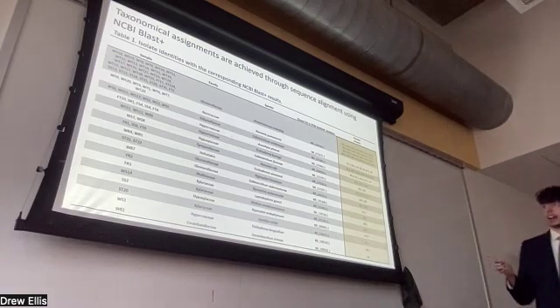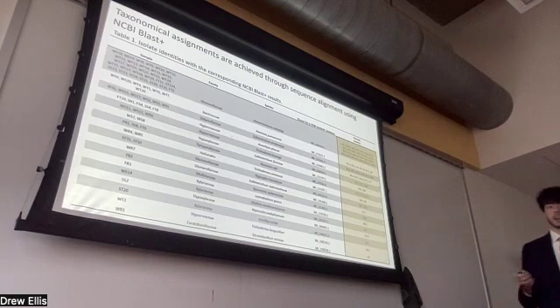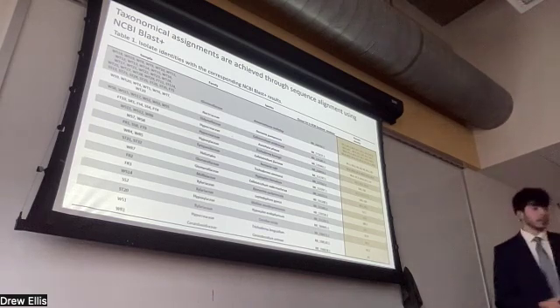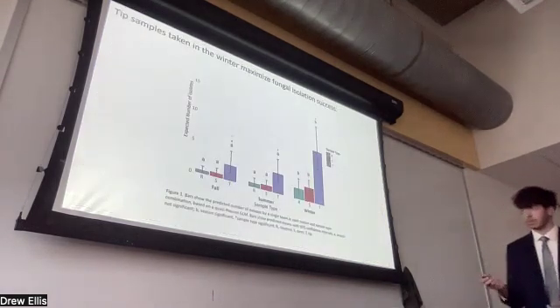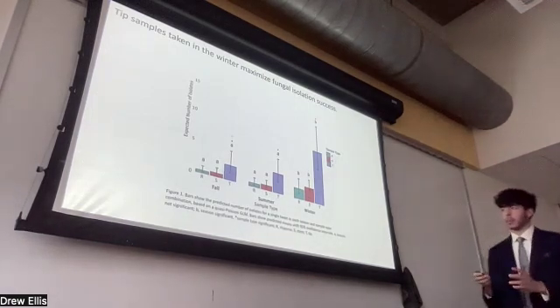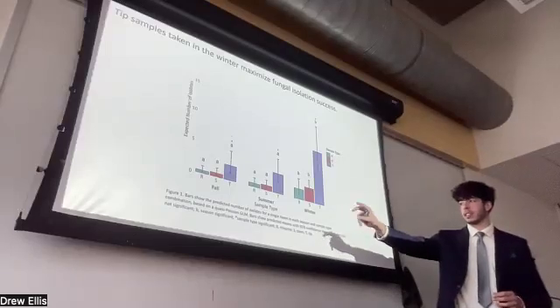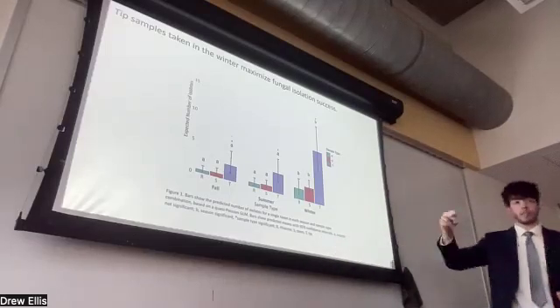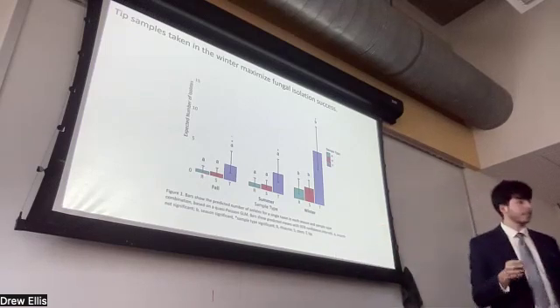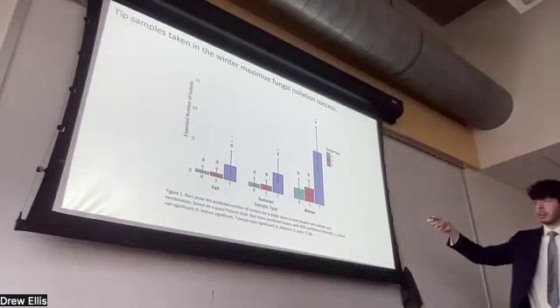And this is likely not actually the species. But for our purposes, we're counting anything within plus or minus 1% as a single species, and that won't affect our statistical analyses downstream. All right, so this is a fun bar plot, and I'll just do a quick overview of what this is showing you. It's separating our samples based on seasons at the bottom, fall, summer, and winter. And if you recall those sections of tissue types, it's RST for rhizome, stem, and tip, and that's for each season, okay? And it's colored based on rhizome, stem, and tip as well.